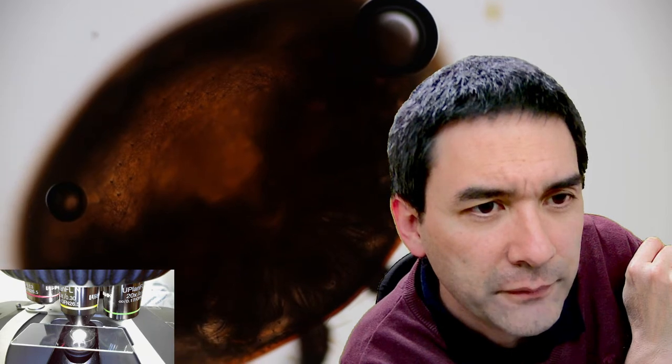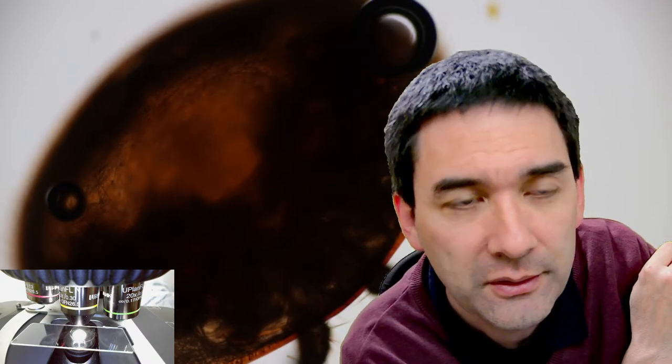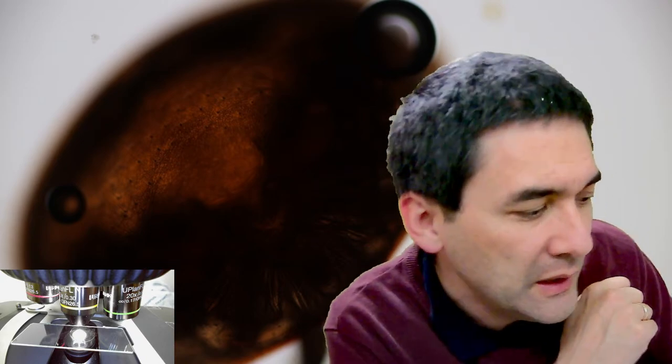Maybe I'm going to show you next week how the mites look. They should be more transparent, because if you look at the mite picture in the thumbnail, usually it takes a little bit of time. I think one of the reasons could be that it takes time for the air to be squeezed out. When this happens, there is not such a big difference in refractive index, and this makes everything appear a little bit more clear.